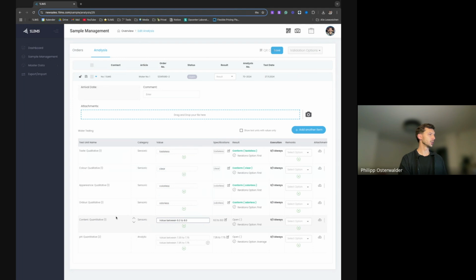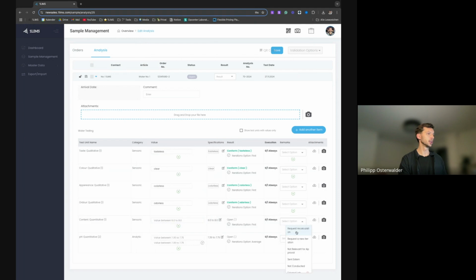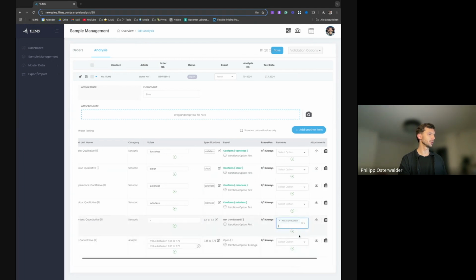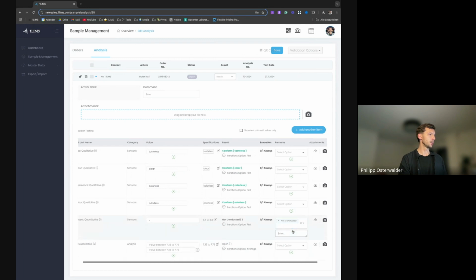The content, I don't know what to do here. It would be any content, ozone content or H2 content. But for today, I'm not conducting this content, based on risk. I can also add a comment: based on risk.